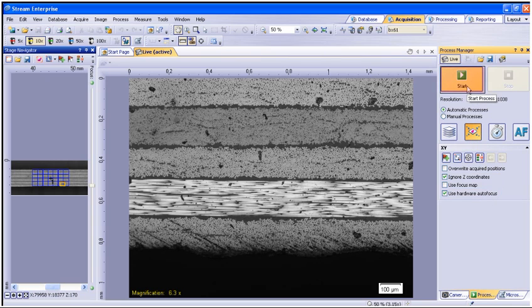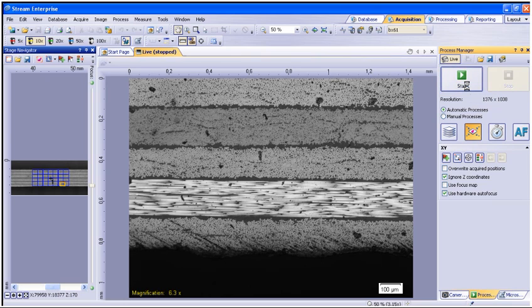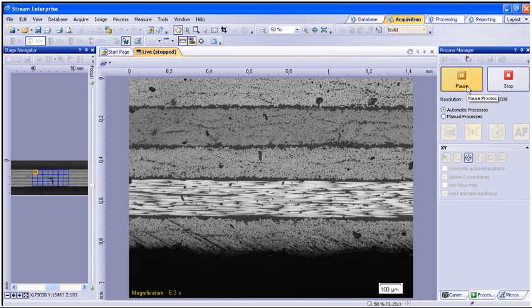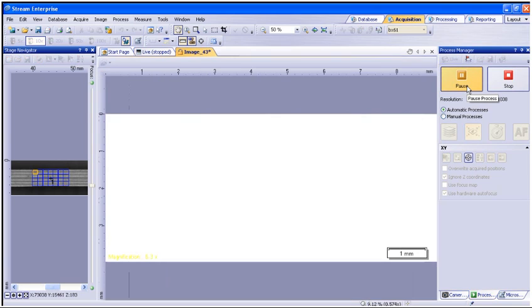To begin the process, simply select the Start button. You will notice the Process Manager tool window change once the scan is started.